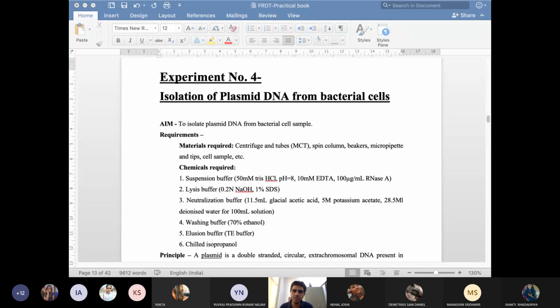Protein is also there in your chromosomes. So now these proteins and single-stranded DNA will entangle with each other. Instead of forming a double strand, the DNA is going to entangle with your protein. That is going to lead to the precipitation of your DNA and protein.